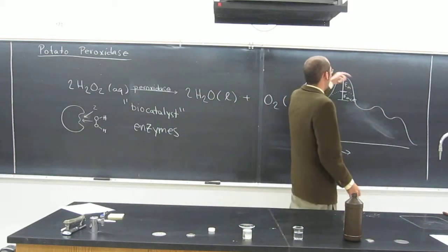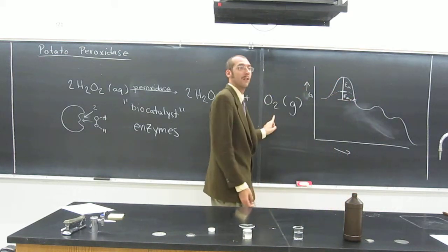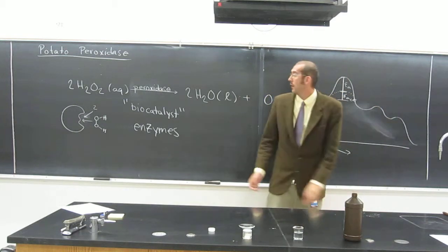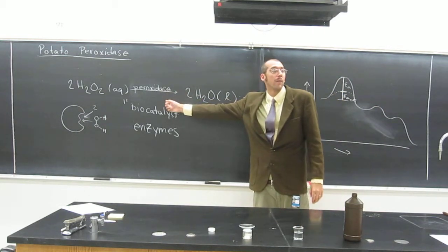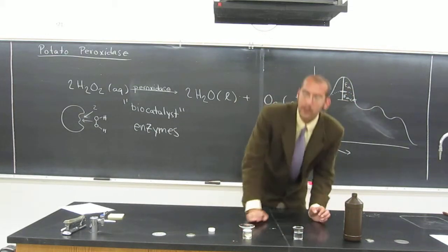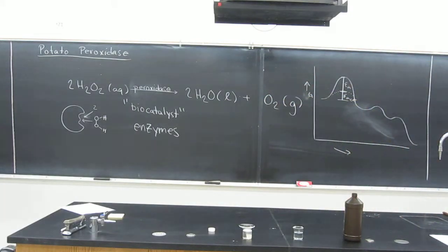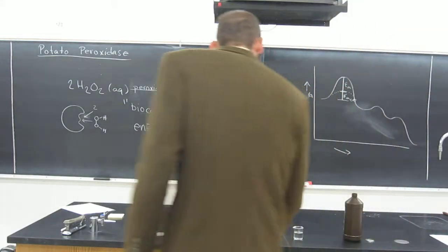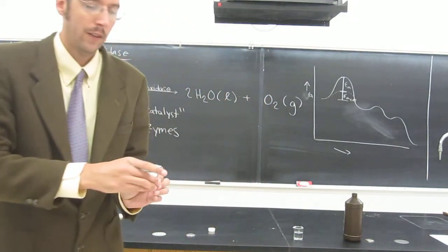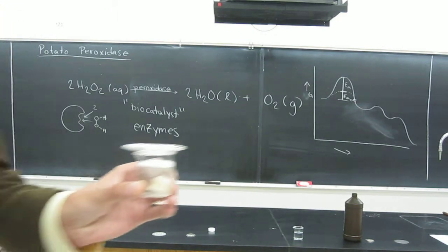But if you've got something in there that's an enzyme, it'll lower that activation energy and allow the peroxide to be turned to hydrogen gas. And, let's see. I might not have enough hydrogen gas in here. Or sorry, oxygen gas in here. And water, that is.